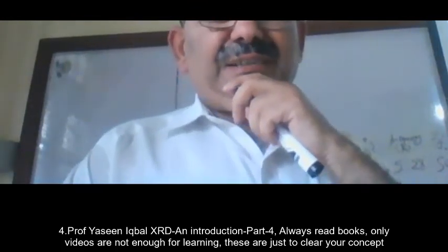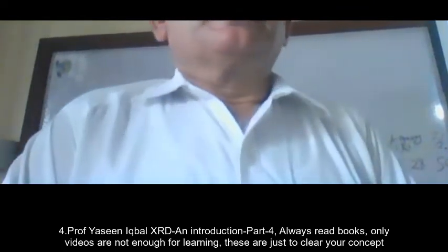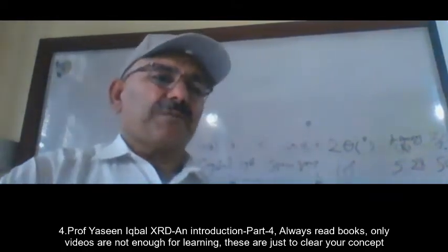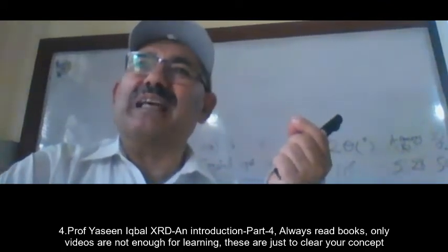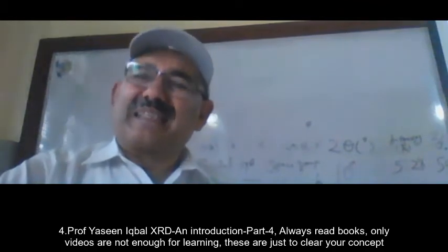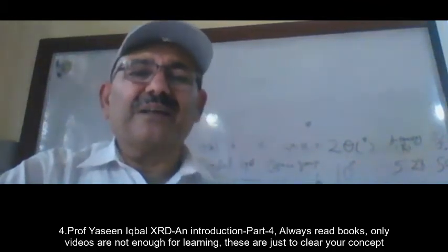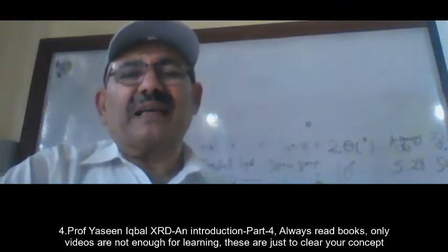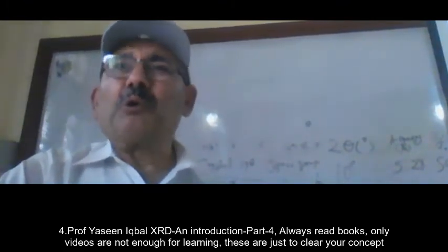Now let us move a little bit. Yes, there are two others. When the structures are very, very complicated, for example for proteins and organic materials, people use small angle X-ray scattering, which is at a scattering angle close to zero.